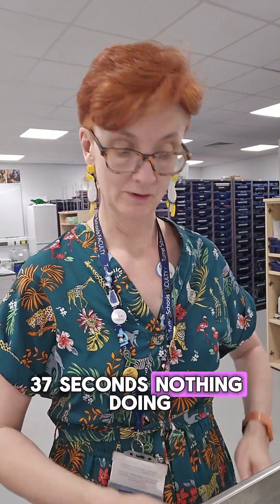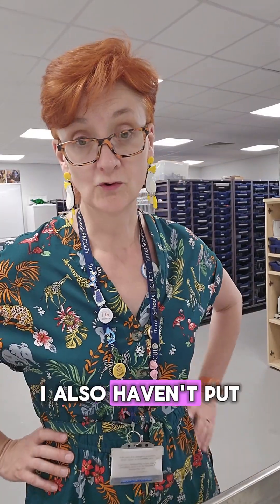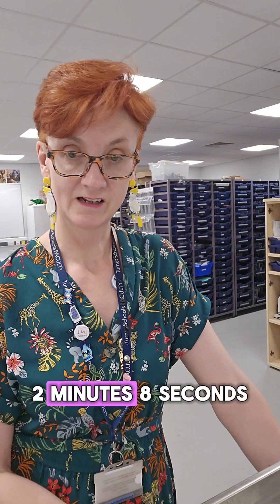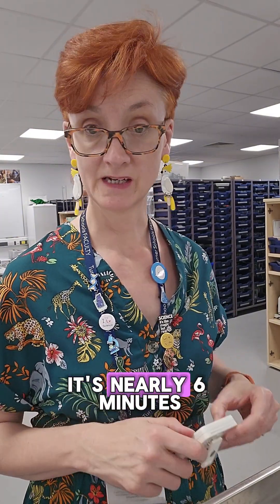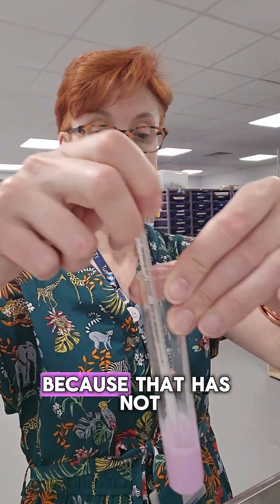37 seconds — nothing doing. It's going to take like four hours; it's not going to be a very good practical. I also haven't put enough water in the water baths, so that's a note for tomorrow: fill up the water baths properly. Two minutes, eight seconds — nothing doing. Nearly six minutes — nothing doing. I feel this practical is doomed to fail because that has not gone yellow. Now we're on 11 and a half minutes.